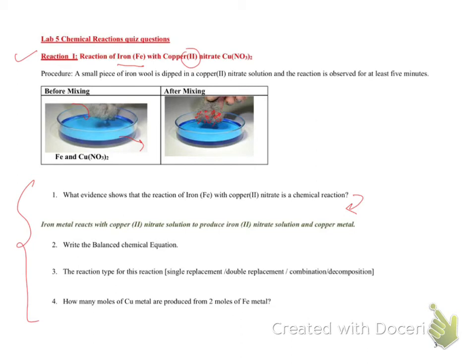Based on this observation, you are first going to write down what evidence it is. It should be one of those 4 indicators that are given on the first slide. Then here is the statement. Based on that, you're going to write down the balanced chemical equation, and from the answers given, you're going to pick the balanced chemical equation.